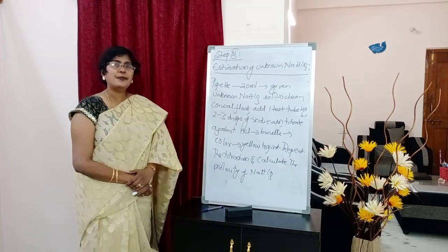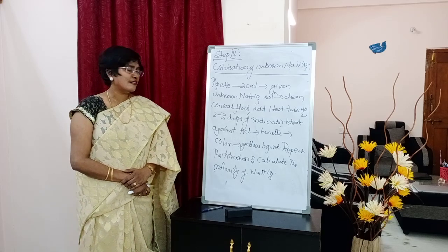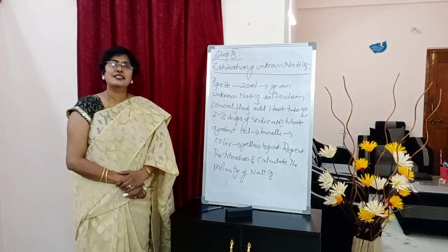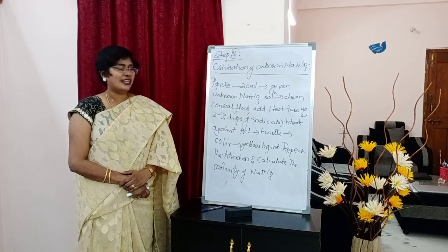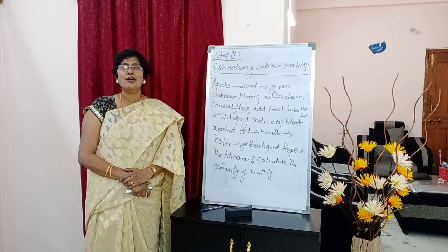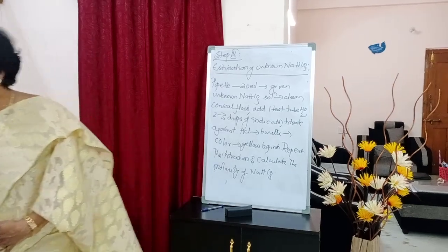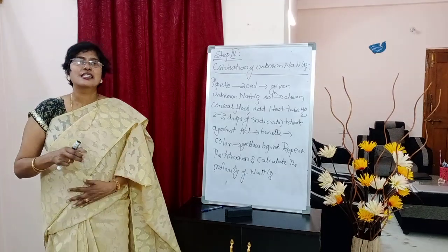Full stop. Repeat the titration and calculate the molarity of NaHCO3. Calculate the molarity of NaHCO3.